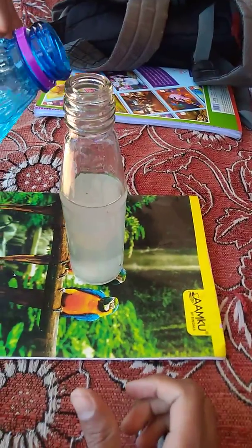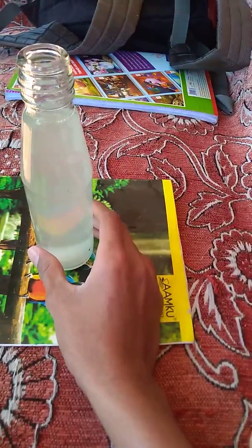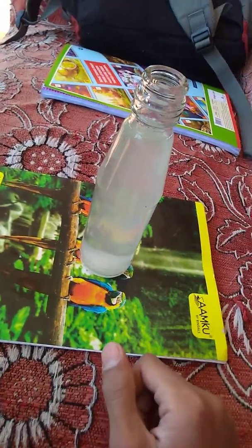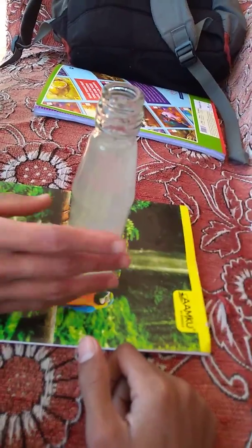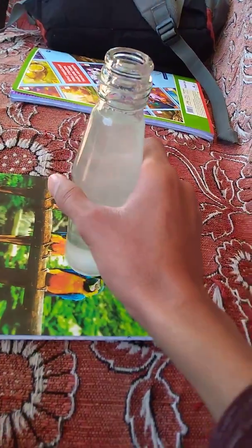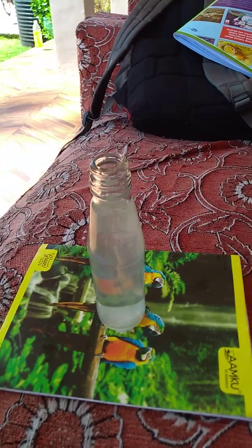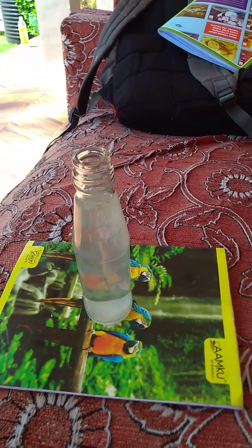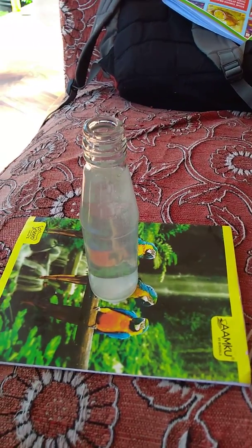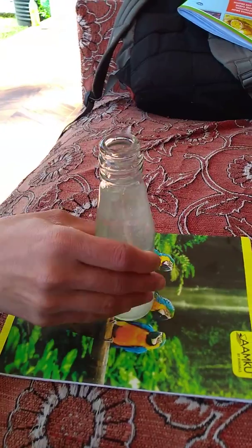Let us put some more acid, because all this sodium chloride isn't reacting — it isn't dissolving. That's why we have put some more acid. This is gradually reacting, but be sure that this sodium sulfate is also dissolved in this. Don't think that this is pure HCl — hydrochloric acid, I mean.